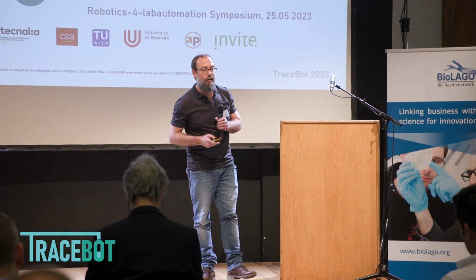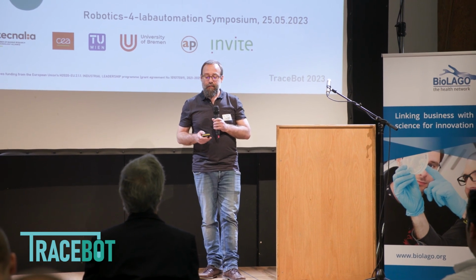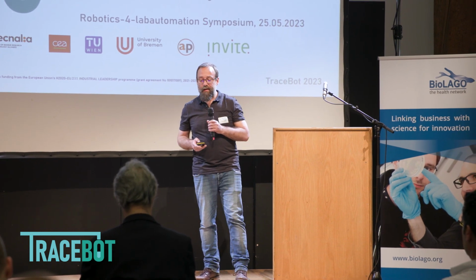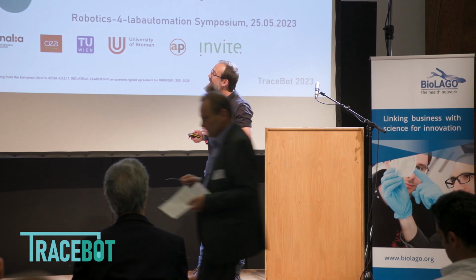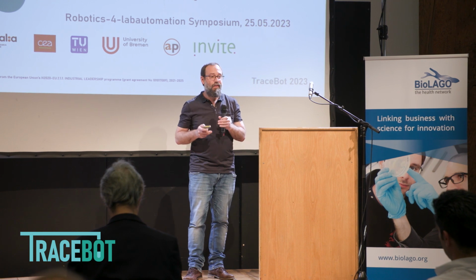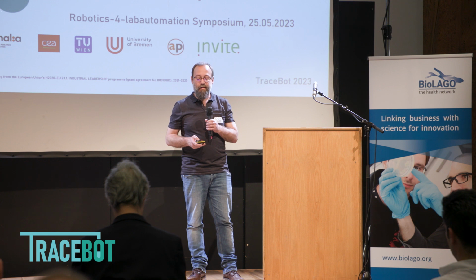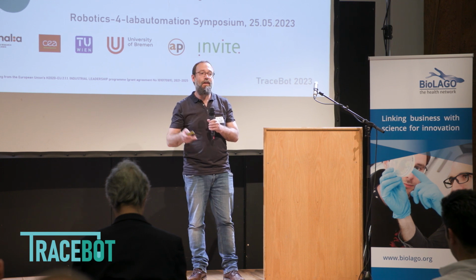Well, I will start describing this TraceBot project. It is entitled Traceable Robotic Handling of Sterile Medical Products. So this is a running project. I will provide you a very short insight about the development that we are doing with all the colleagues involved in that project, and I guess that my colleagues later on during the session will provide more details about each of the different aspects.